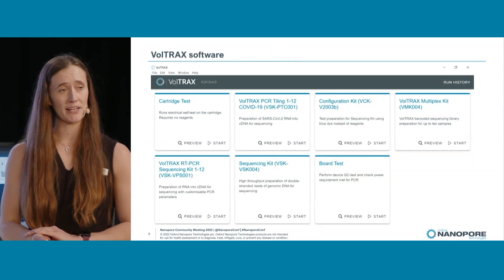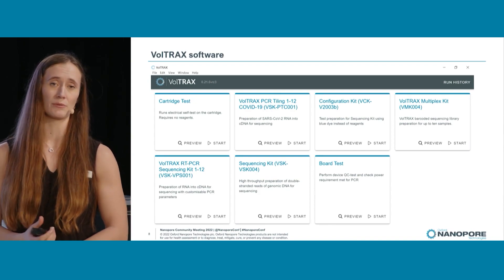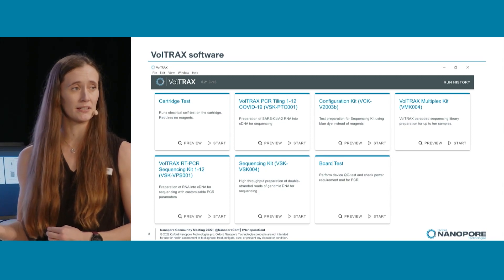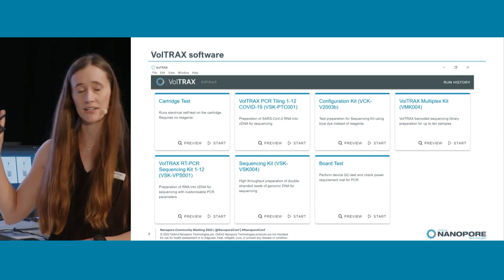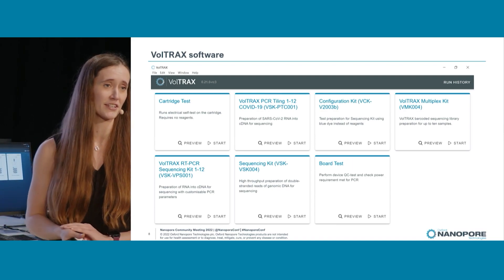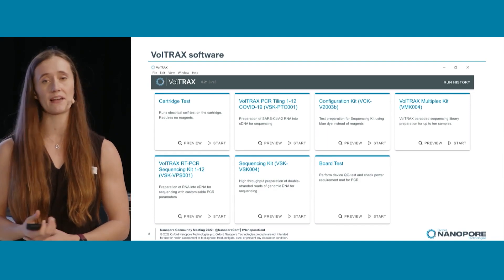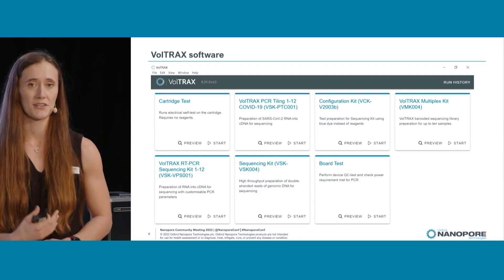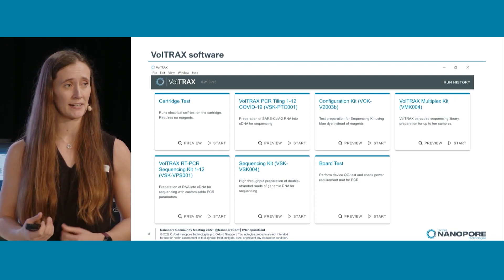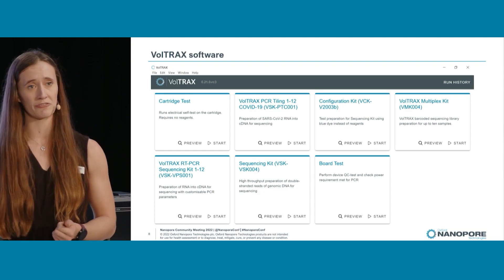Here we have the protocol selector page from our software, showing the protocols which are currently available. We have two QC checks — one checks the cartridge, one checks the device — just to make sure all the electrics are working as they should be. We have our Voltrax sequencing kit, the VSK, which was the first protocol we released. That's a fragmentation-based method with a bead-based cleanup, giving you high throughput and long read lengths.